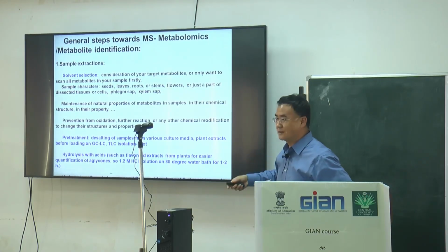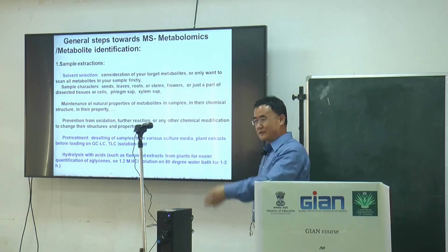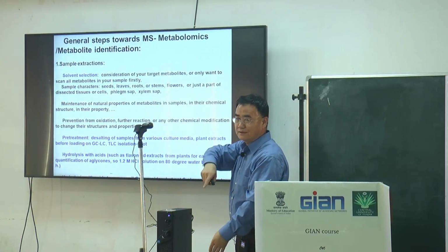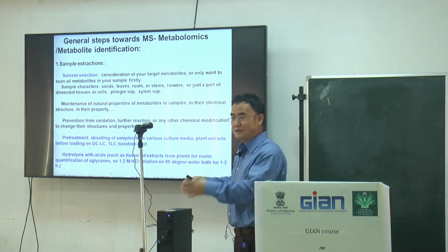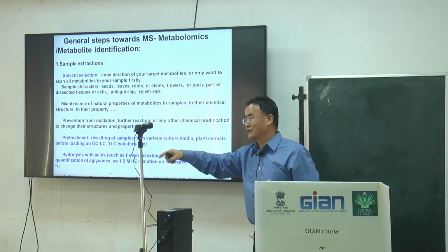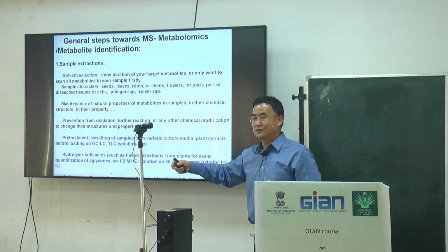Another way is to use TLC to quickly isolate the compounds. You can do two divisions. In the first, you develop with one solvent ratio; in the second, you change the solvent. Then cut off the single part and use chloroform or methanol to extract it.